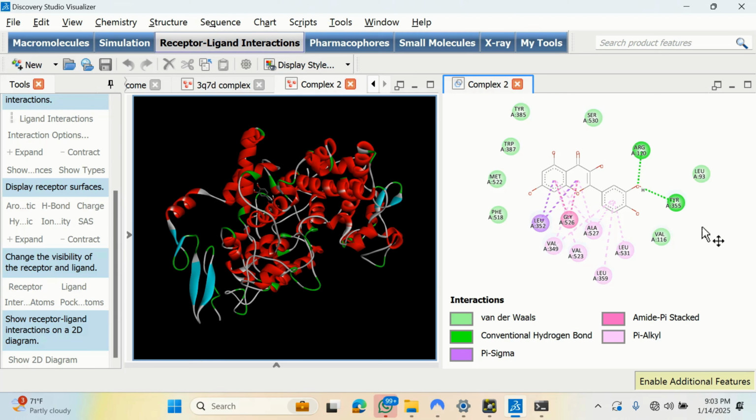Then after that, you can bring in your external ligands or synthesized product and all that. And the nature of interaction, the kind of interaction and the strength of it made by your external ligands or your synthesized product should help you have an informed choice for the best pose for your study. Don't just choose any pose out of the nine and report a 2D view that has poor interaction with respect to your key amino acids or key residues.